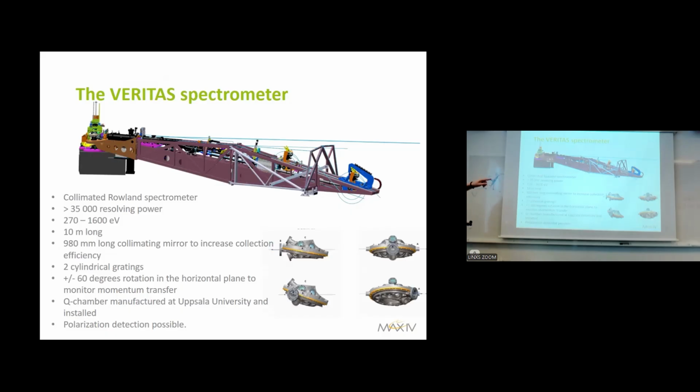And we have prepared, if you look at the blue design on the right hand side, a polarimeter design where we have 2 detectors and the possibility to put in some multilayers to be able to measure the polarization of the scattered light. This is still in development, but we have all the mechanical pieces we need. We have 2 detectors. So this is a future development. Once we have a science case showing up, then we really want to pursue it. So that's something to remember.